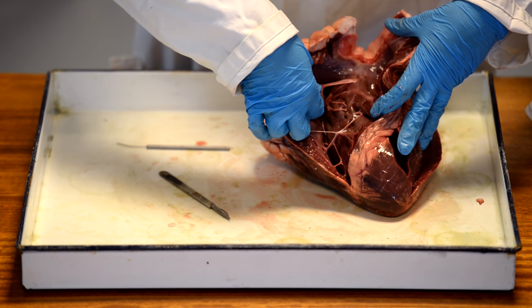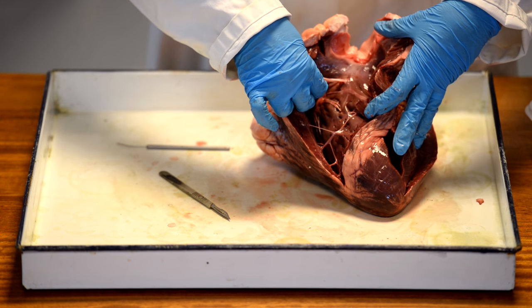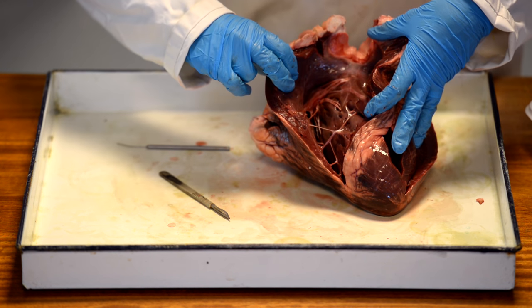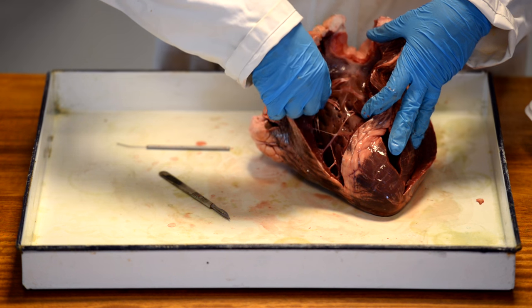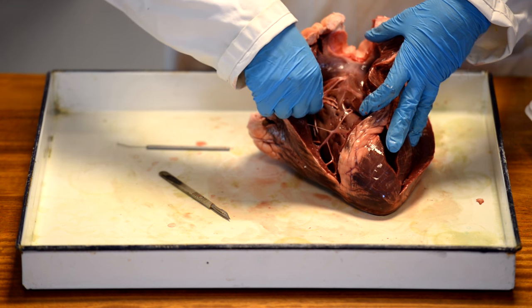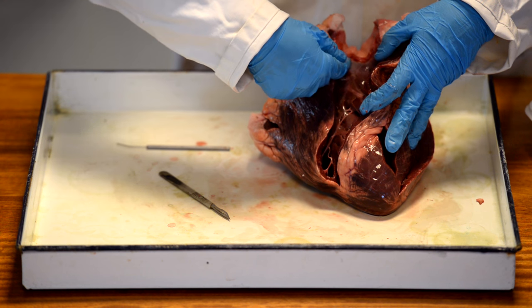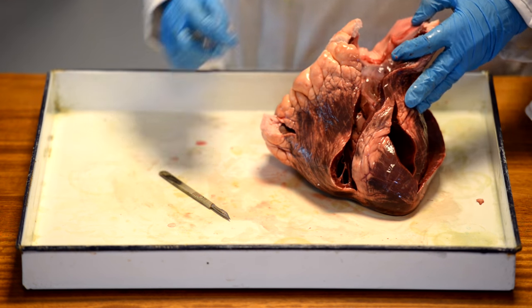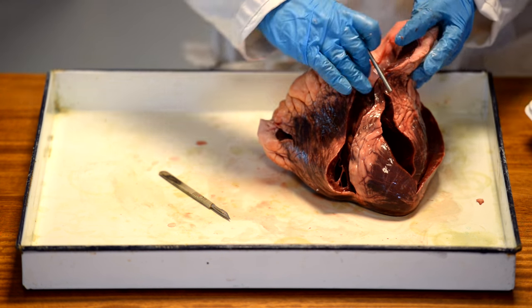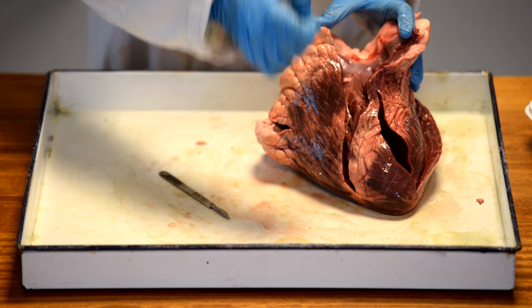You've got the strings, basically tendon tissue, that hold the valve from going inside out. It is not a correct name, but I call these parachute valves because when the heart beats, the strings stop the valve turning inside out in the same way the strings of a parachute stop the parachute turning inside out. The heart beats, the blood leaves, and it is probably even easier to see now these pocket valves that prevent the blood from flowing back in between beats of the heart. Otherwise, the blood would flow back.